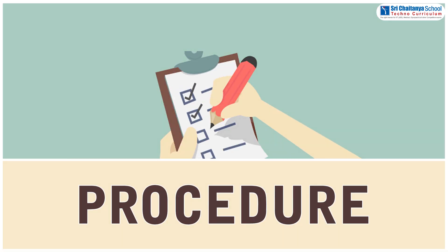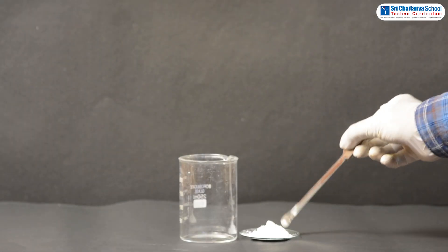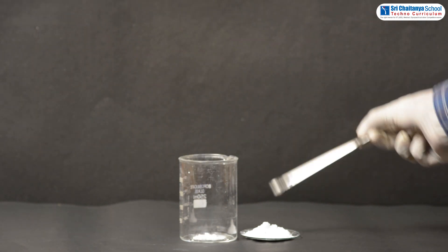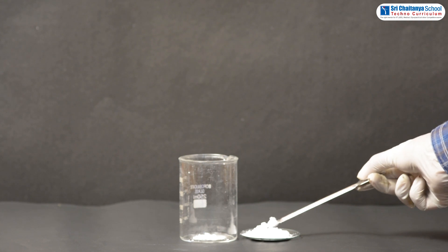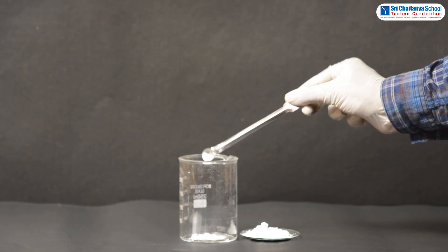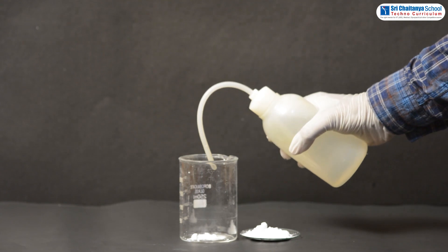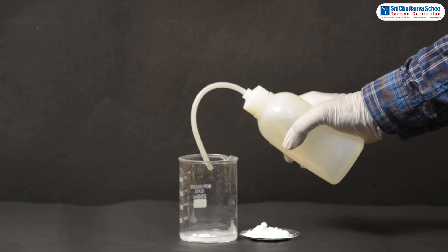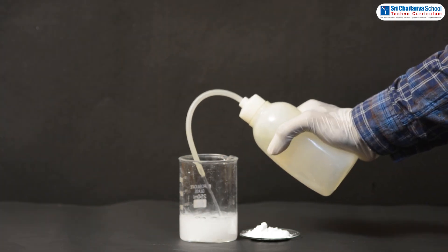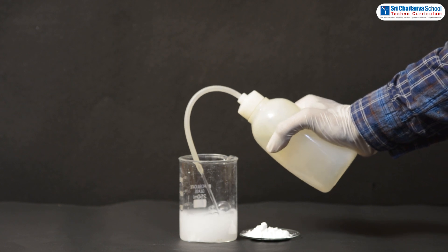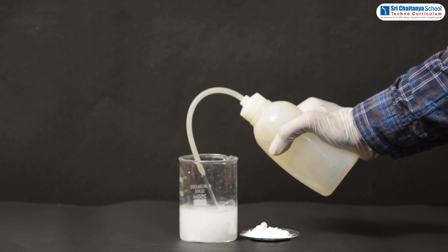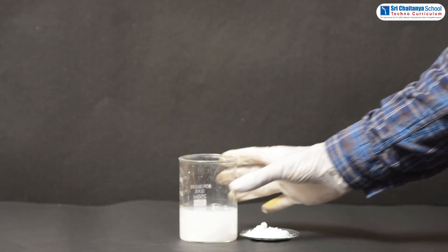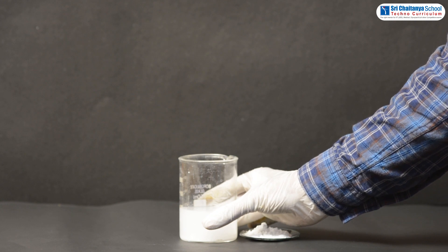Now it is time to see the process. Take some quick lime in a beaker, pour water over the quick lime in the beaker slowly. Touch the surface of the beaker and observe carefully.